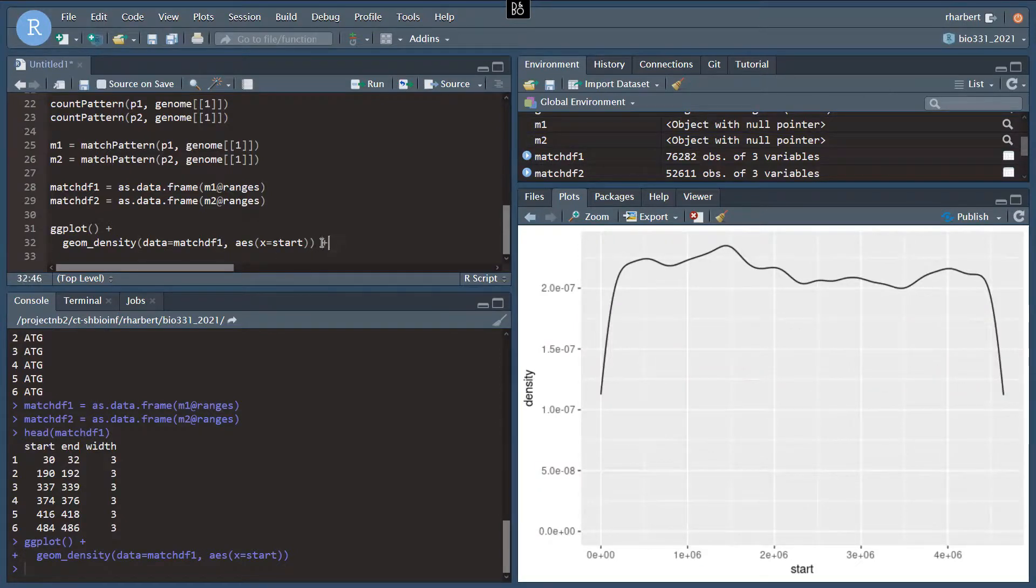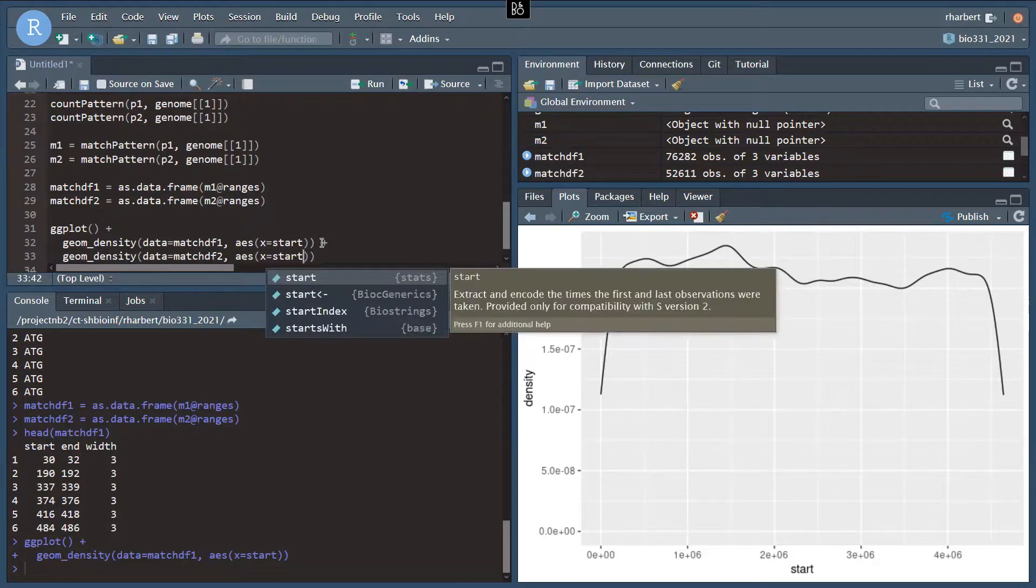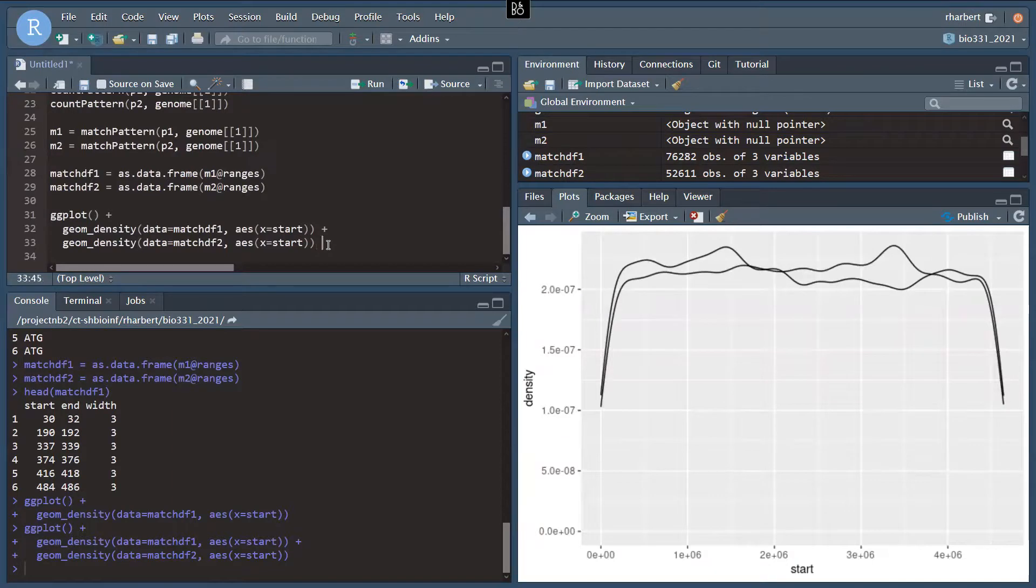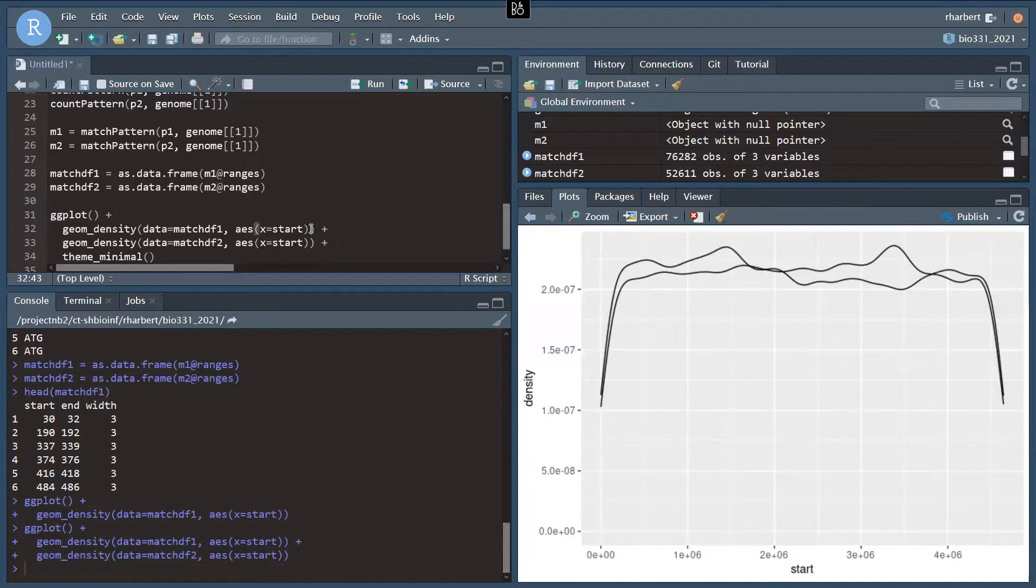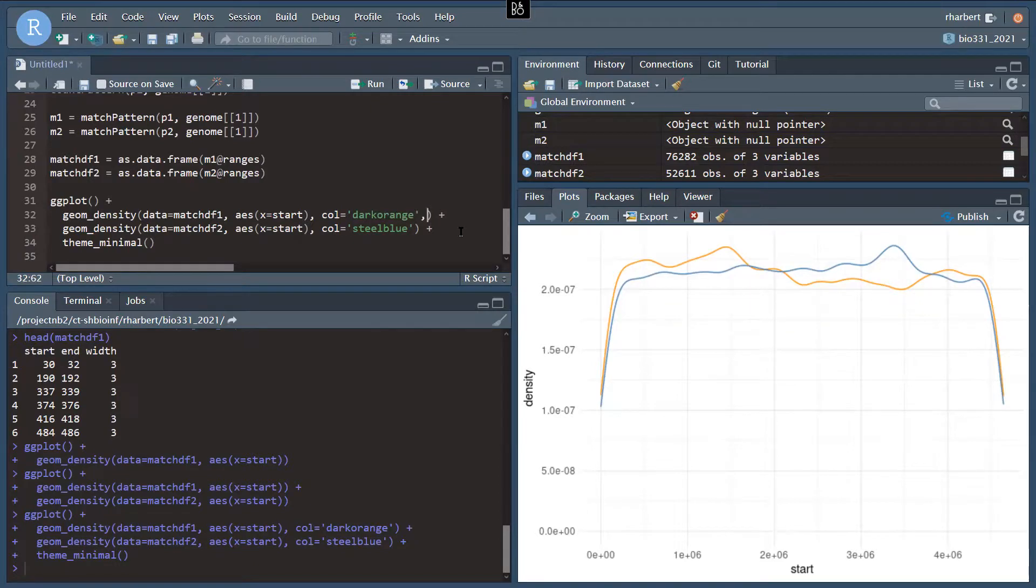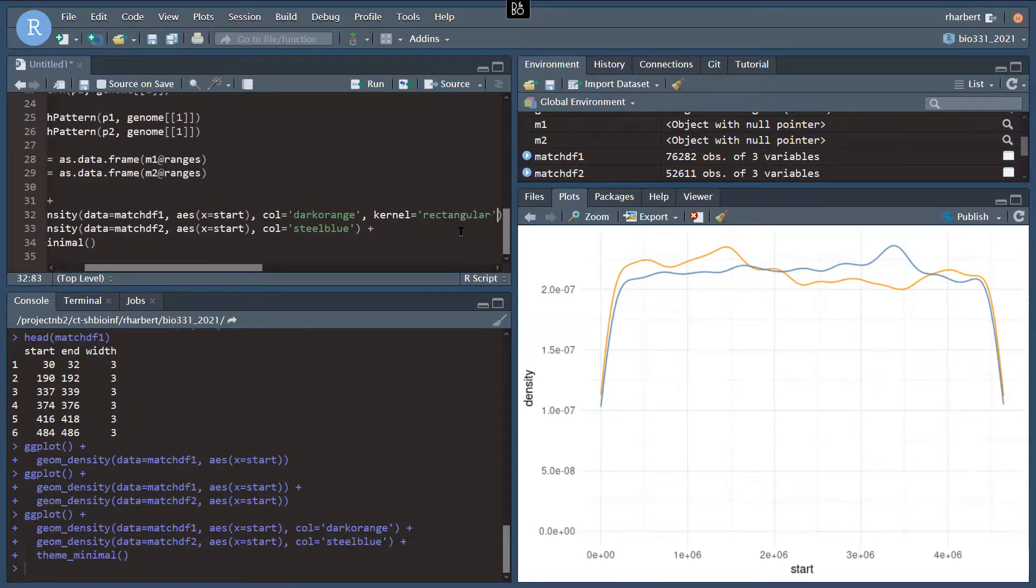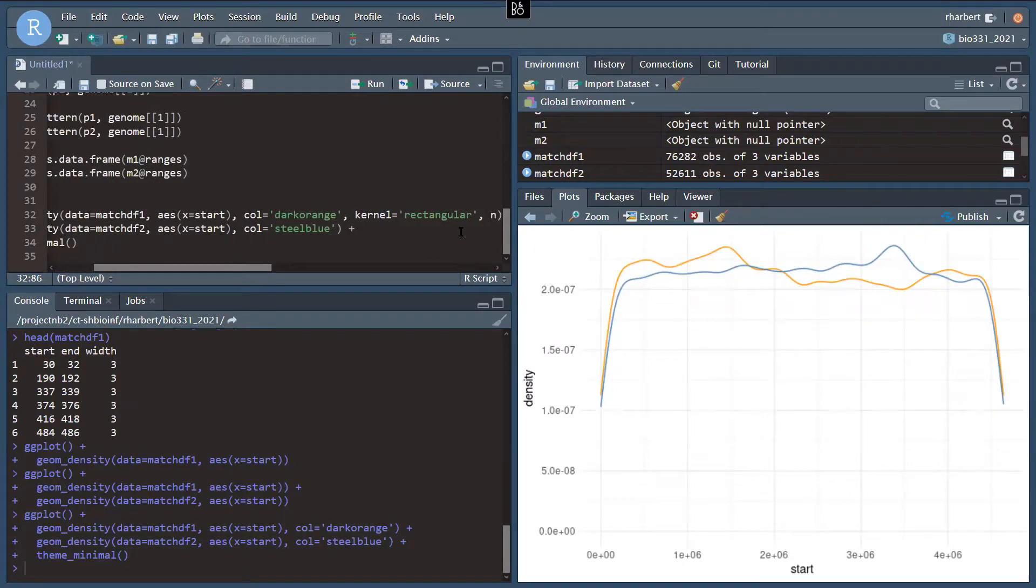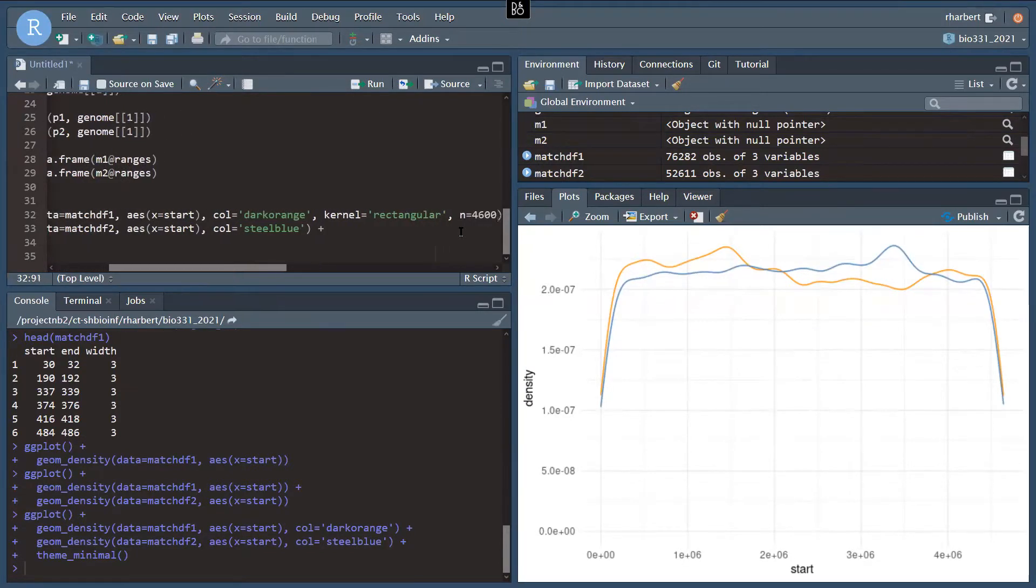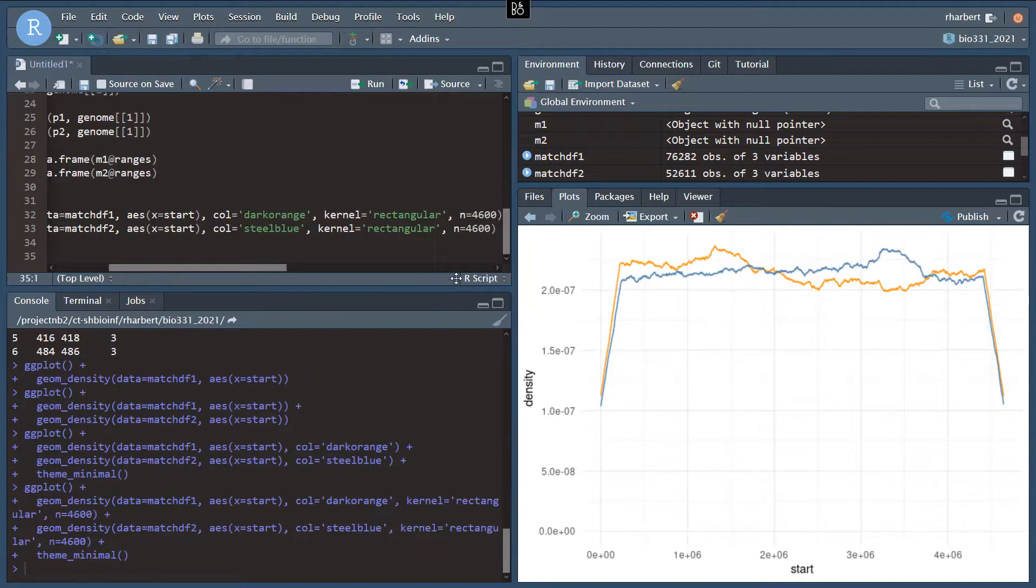Aha, there we go. All right, let's add the second series, and then we'll customize it. So same setup, just a different data frame input. That looks good. Now we have both series. Let's do theme minimal. Let's add some colors here. That's better. I don't like the smoothing on these Gaussian density functions. I'm going to give it a different kernel. I'll use the rectangular kernel, and I'm going to have it interpolate at n equals 4,600 points. There's about one every thousand base pairs here.